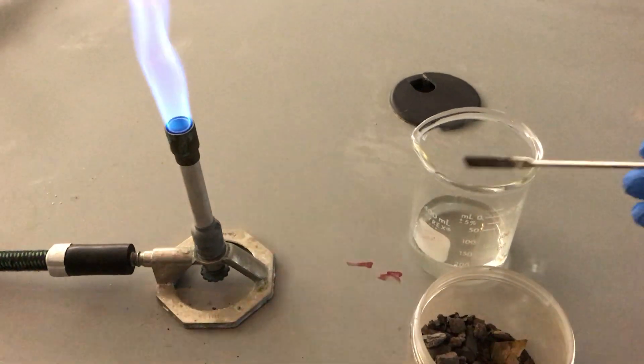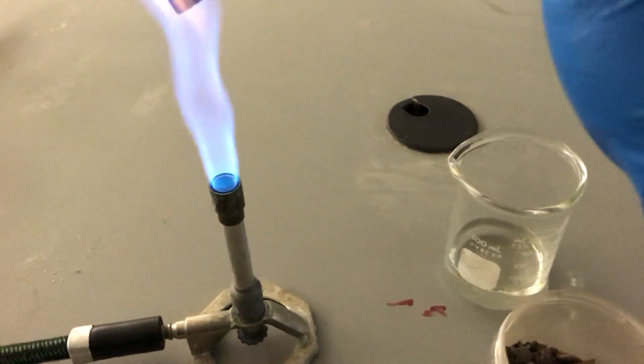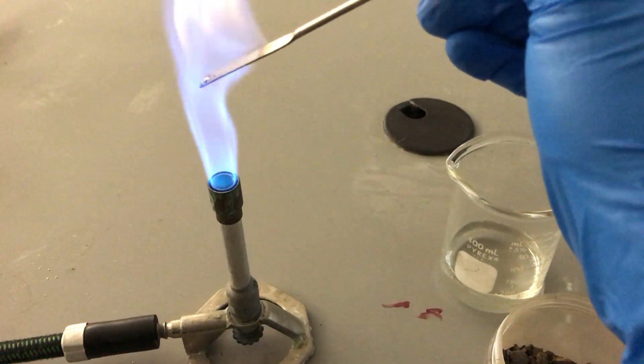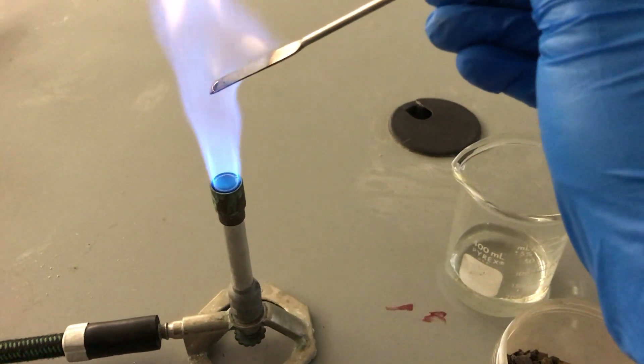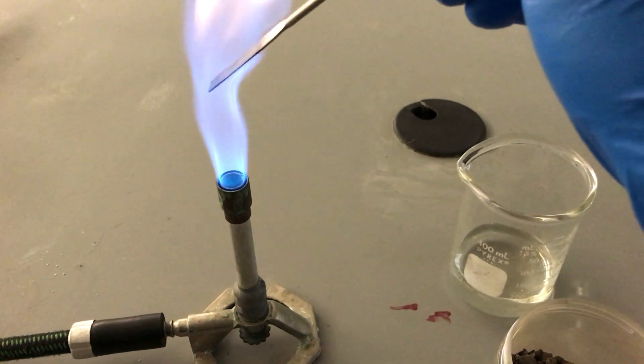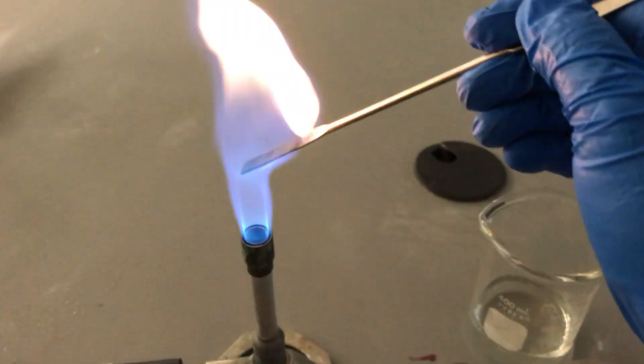And then we're going to do the same thing with our suspect sample. So once again we're going to flame off our spatula, making sure it's nice and dry.